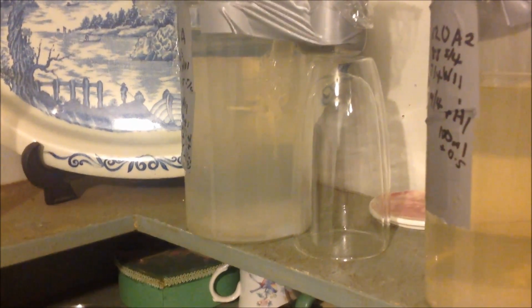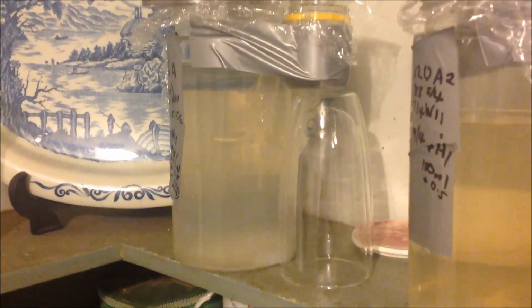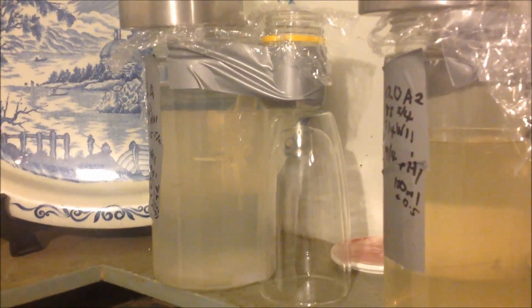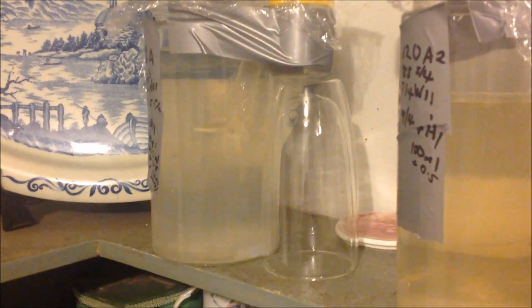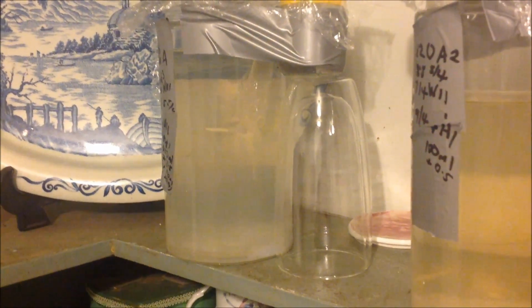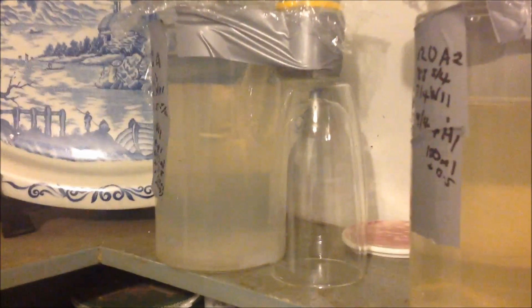You can just make out a tubule growing again. About 12 hours ago I topped up the little piggyback bottle of sodium hydroxide, and it's definitely growing from the top down. It's so hard to focus it. It's on the other side of the jar, and the focus wants to grab this side of the jar, but it's growing about half the way down.